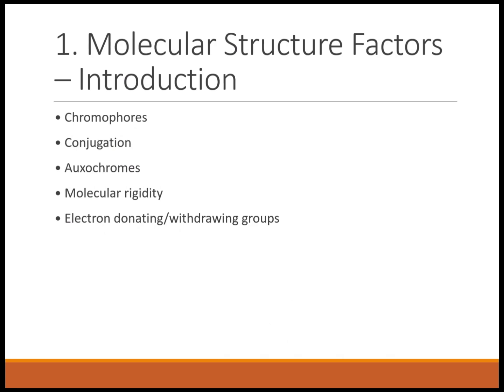Now we begin with the molecular structure factors. These are internal factors controlled by the molecule itself.